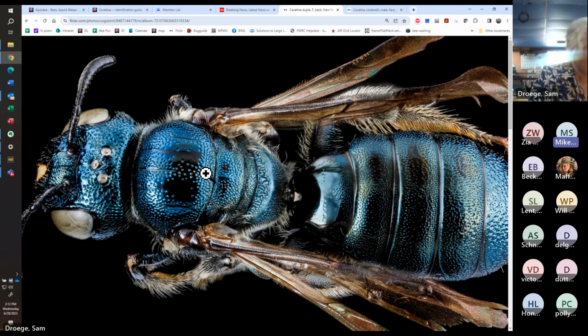Wow. I'll have to sit down and take a bunch of pictures and send them to you all. Yeah, this one sort of peters out like the one on the screen. Yeah, I mean, this is a worthy couple hours of looking at. Now I'm going to look at calcarata and see what the pattern of the Slater lines are across species and see if they're useful. It's one thing to have Slater lines. It's another thing to have useful Slater lines.